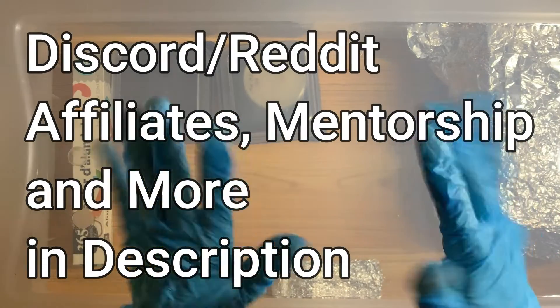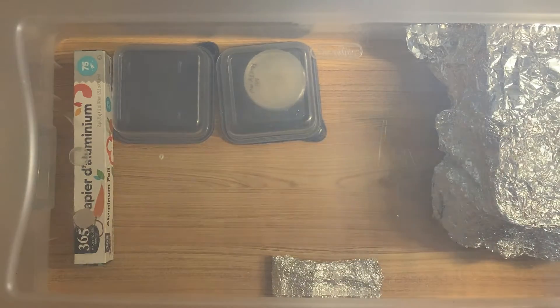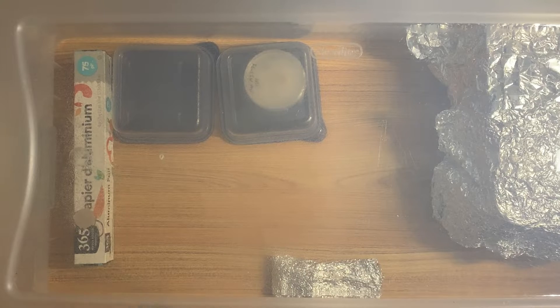Hello everybody, this is Mycophile Sage checking in here today. Today I wanted to release the first SAB video of this channel. I'm going to be doing some agar to grain inoculation inside a SAB. I have six jars inside the SAB and I have two plates, and I want to split the plates each three ways — so one little wedge per jar.